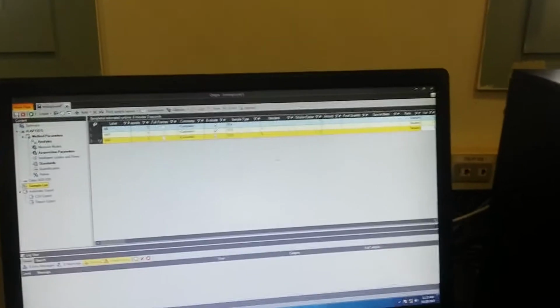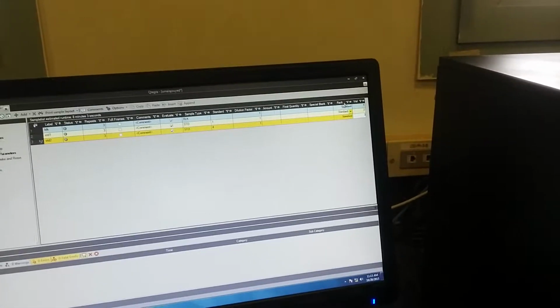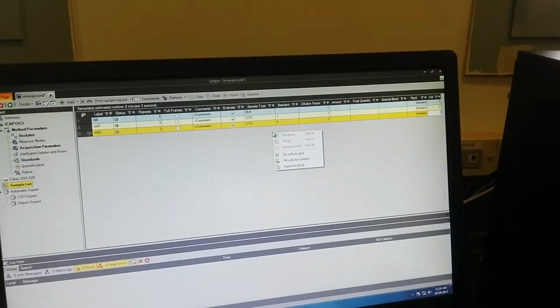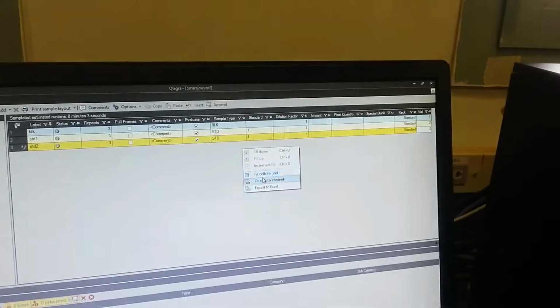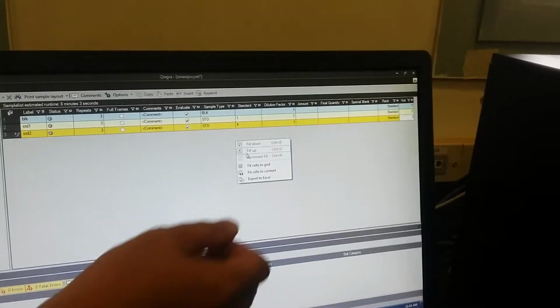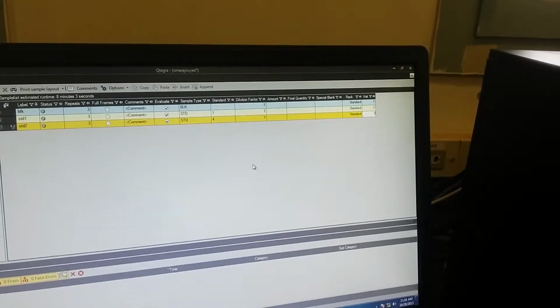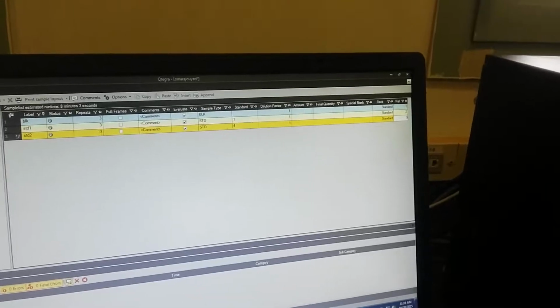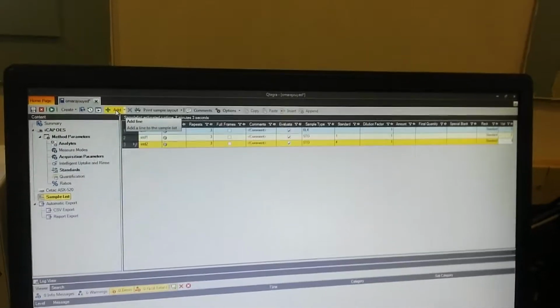That's one thing we can do also, doctor. We can fit the screen. Brush it on the three. Okay, done. Right click, fit cells to grid. So where did we get it from here? Fit cells to grid. And if we want to go back, fit cells to content. No need to, because sometimes you will forget, you know.